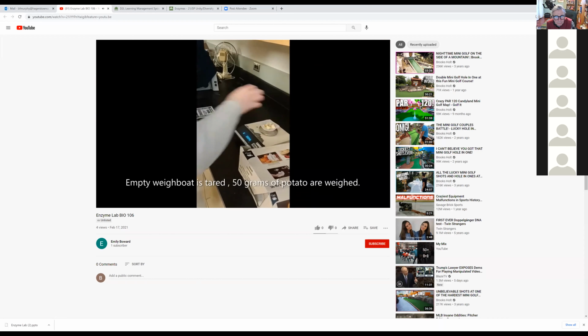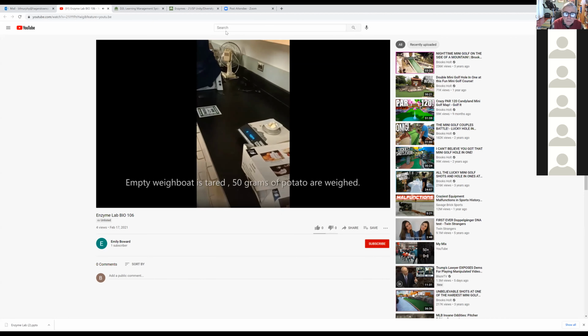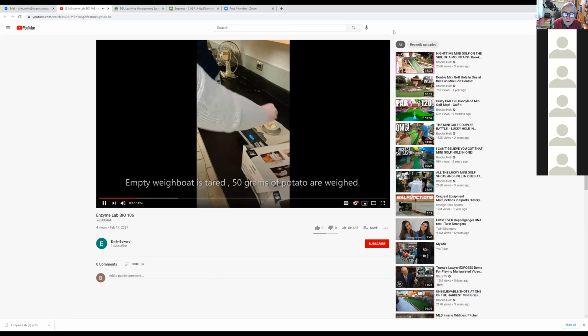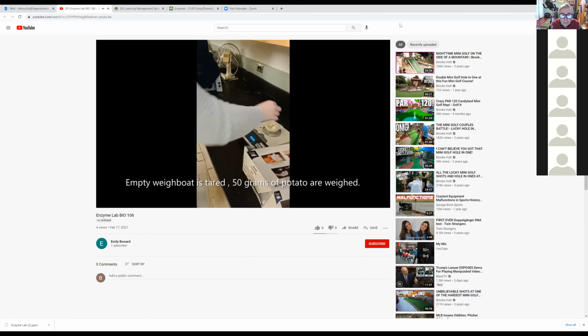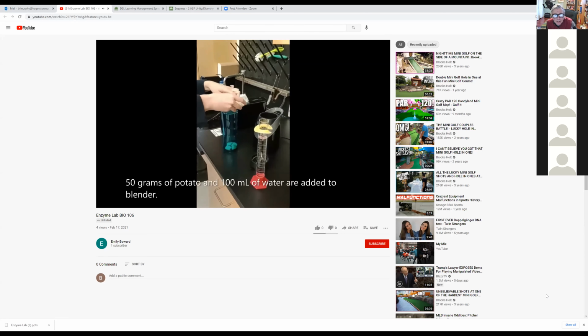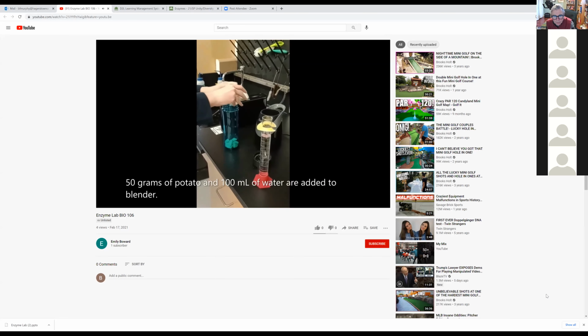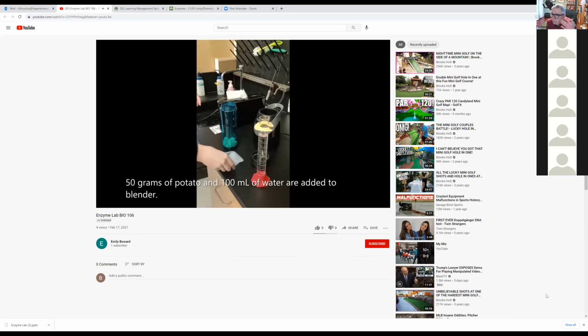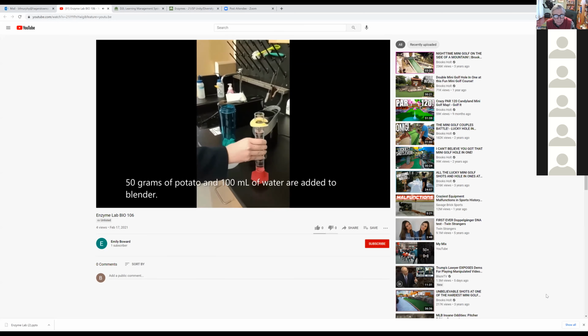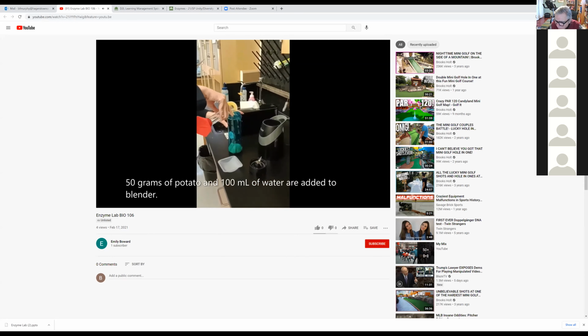This was yesterday in section 01. Then they add the potato and 100 mils of water to a blender to make a potato slurpee or smoothie, frappe. Yeah, I'm gonna turn the music down.